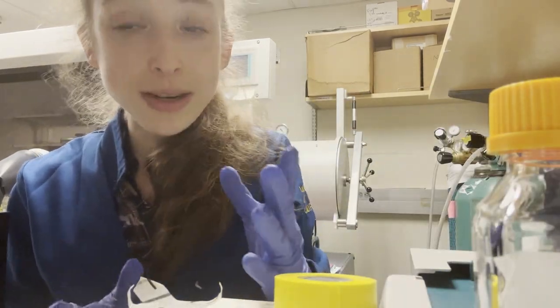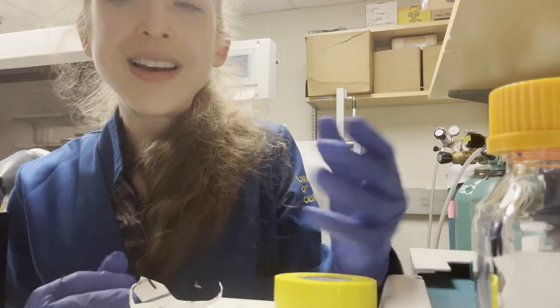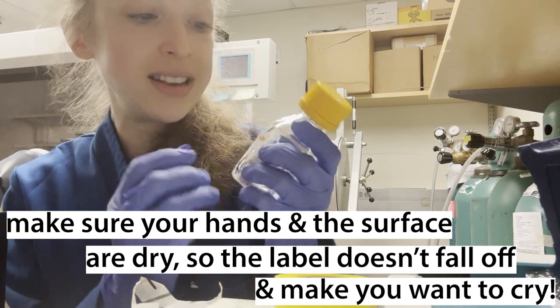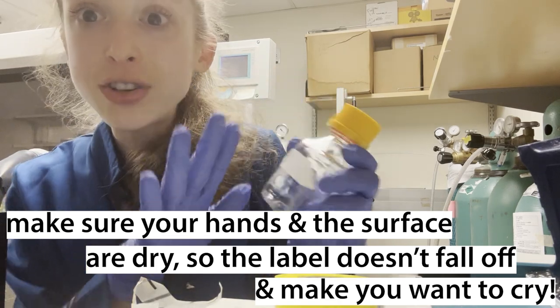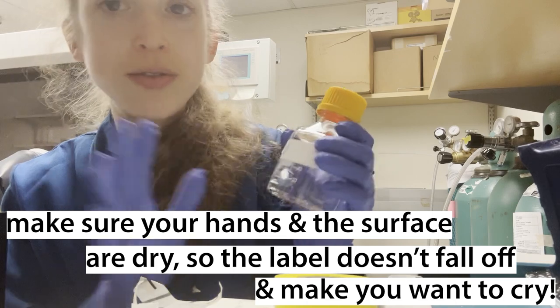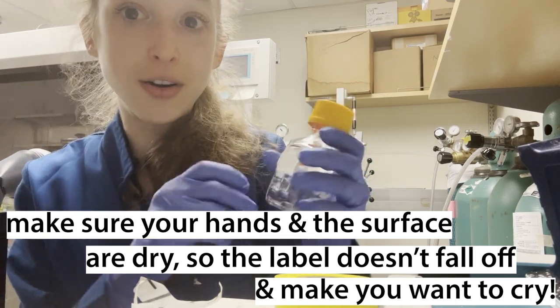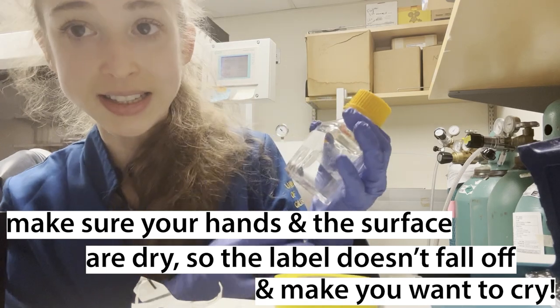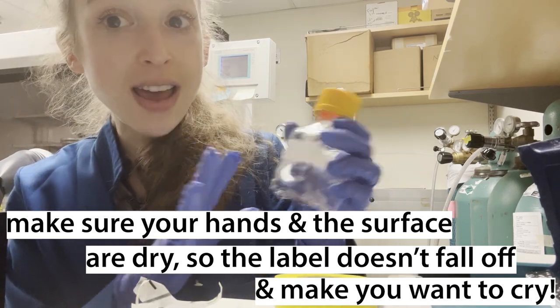Sometimes you have the opposite problem where your labels won't stick. This probably sounds obvious, but make sure that your bottle is dry and there's nothing spilling out. Make sure that your gloves are dry when you're putting on a label. You have no idea how many times I've been in a hurry with wet gloves or a wet bottle and tried to slap a label on there and it just slides off. So make sure everything is dry.